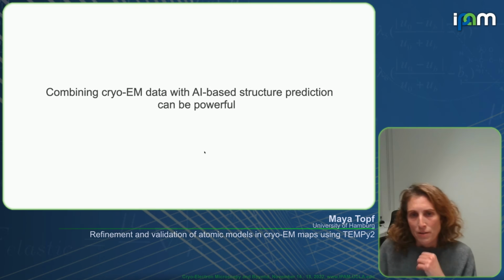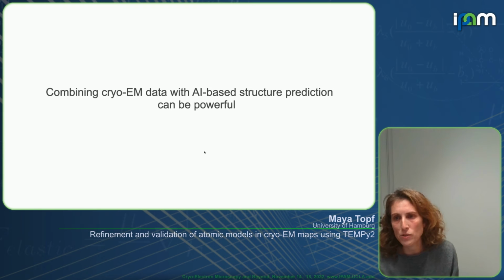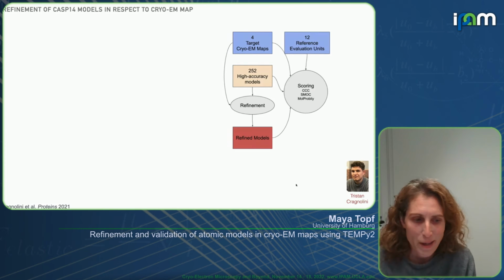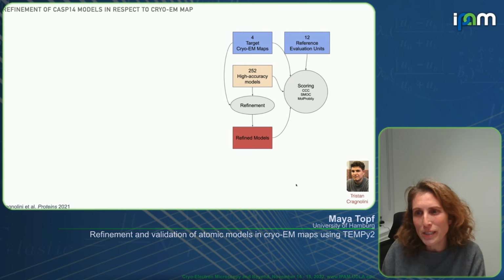Okay. Finally, I just want to say something that you probably already know, which is that combining the cryo-EM data with AI-based structure prediction can be very powerful. So Tristan, who developed TEMPy2, not sure if I said it before, is now not in my group anymore. He's moved and became a lecturer at Birkbeck College in London.